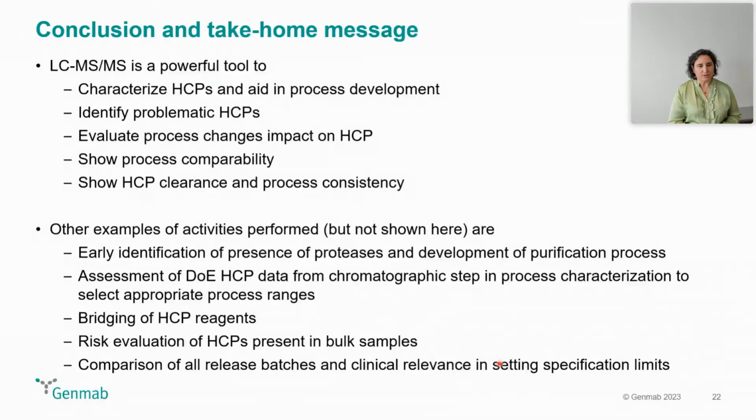We have also used LC-MS to assess DOE HCP data from a step in process characterization in order to select the appropriate process ranges for that step in order to show the maximum clearance of HCPs.